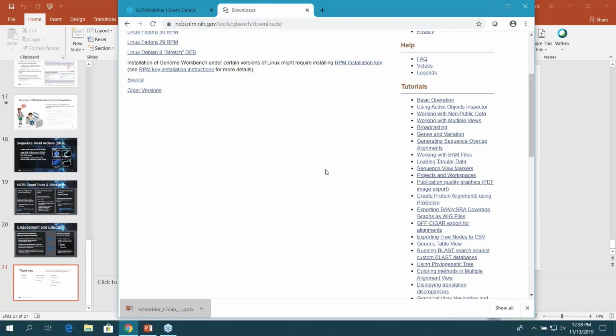Okay, I think we'll do one more question, but I'm not sure I completely understand it, and maybe you will. The question is, is there an easy way to show regions which have overlap between multiple tracks and capture this information in the viewer? For example, I want to focus on genome regions which have significant overlapping regulatory features such as TFs, DNase, and ENCODE peaks. We don't have a mechanism to jump the browser to places where there is overlapping data in lots of different tracks.